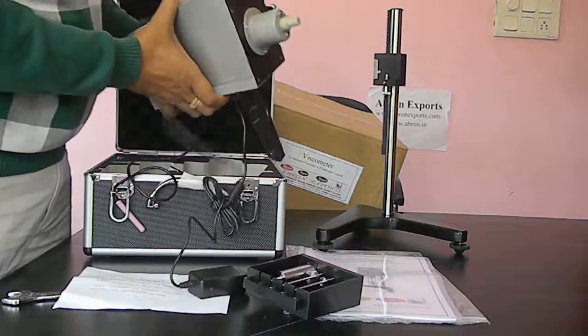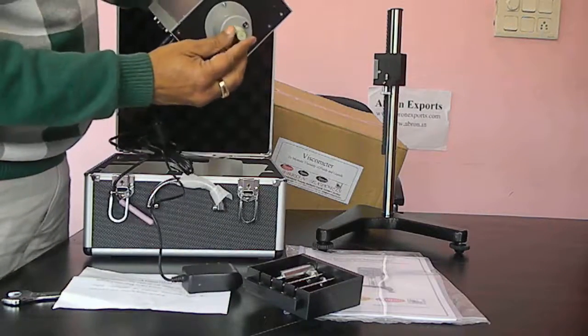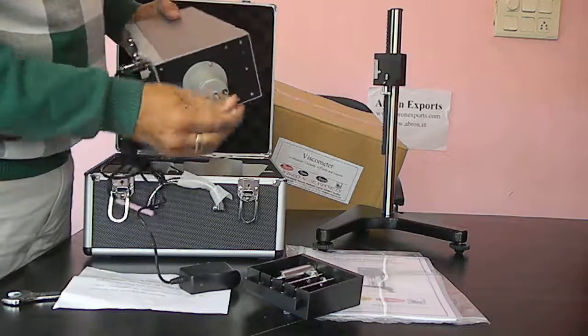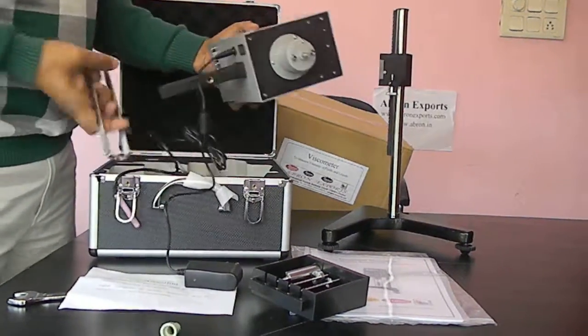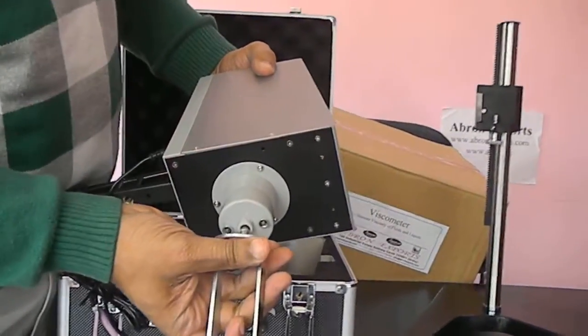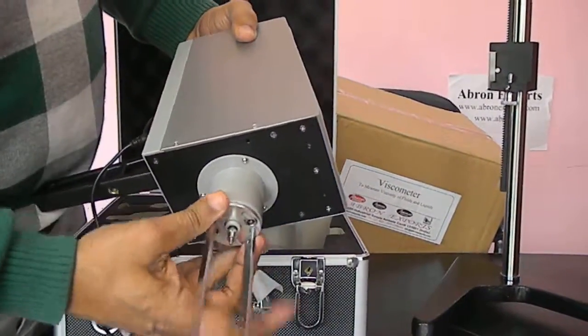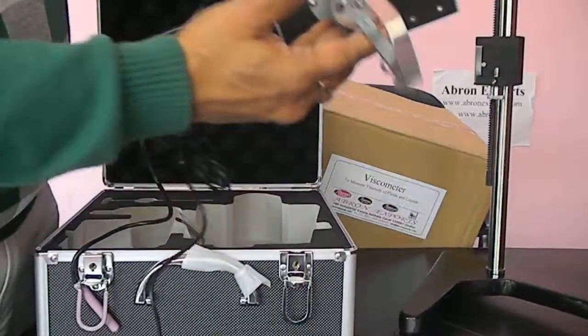This viscometer has a digital control. We first remove this for putting the attachments. This can be put only after this has been removed. This secures the place.